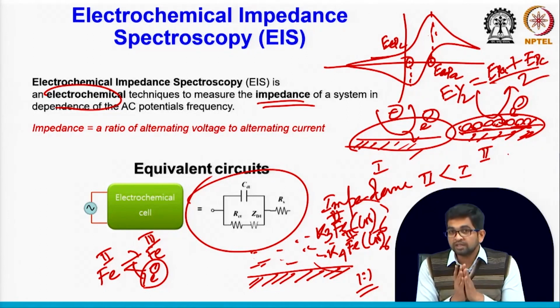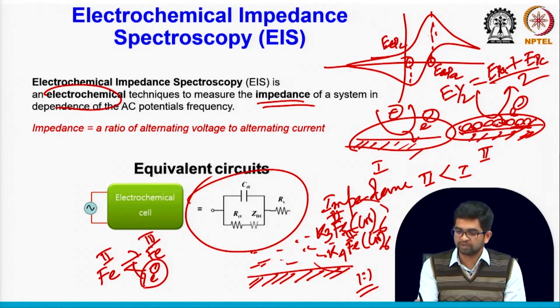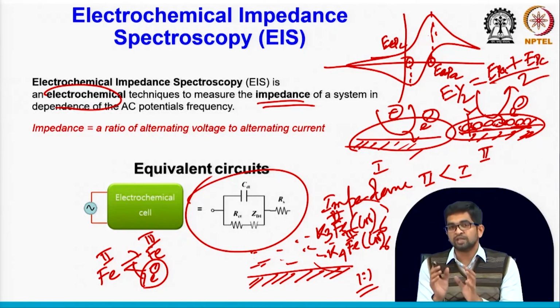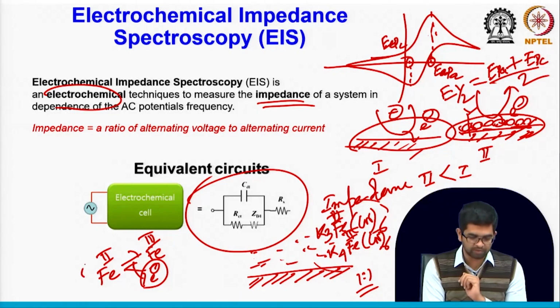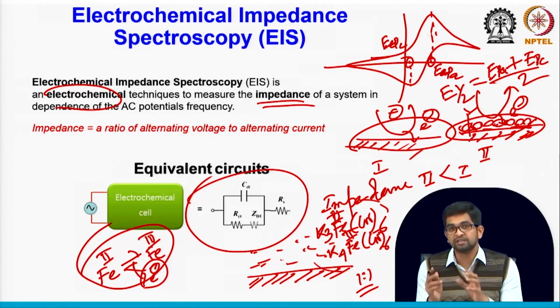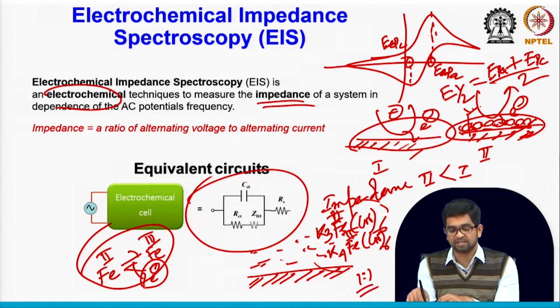One thing you have to remember, biological molecules are not very conductive, like protein molecules. So, if your proteins are immobilizing slowly, step by step on the surface, your sensor surface impedance will slowly increase, because they hinder the electron transfer rate. You have to keep that in mind. While we measure the impedance, we are measuring the number of proteins, how they are immobilizing on the sensor surface.